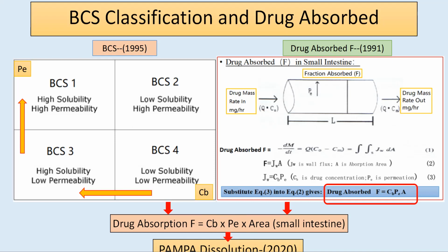We invented this PAMPA dissolution, and literally these CB and PE can be simultaneously measured and we are able to see the drug formulation performance, right?